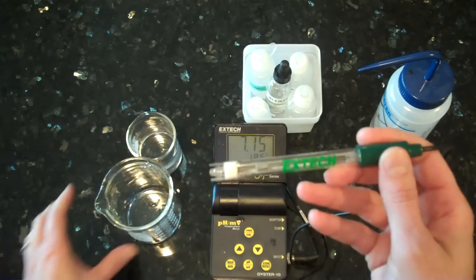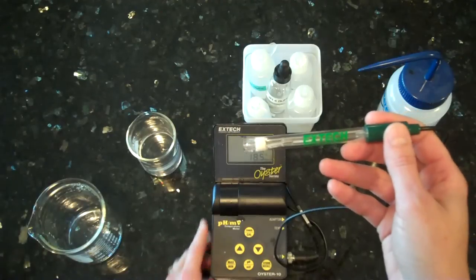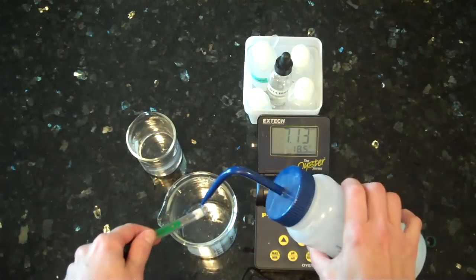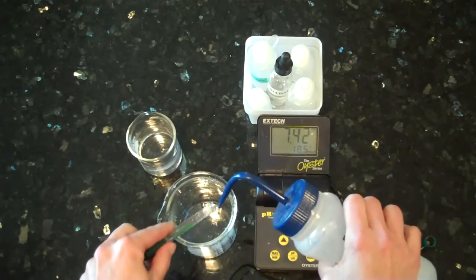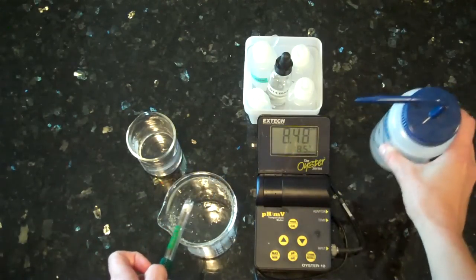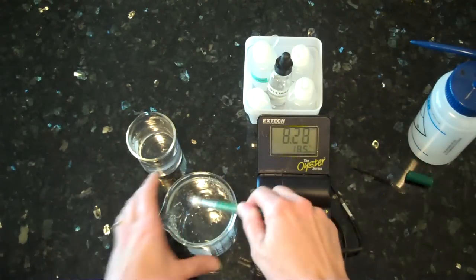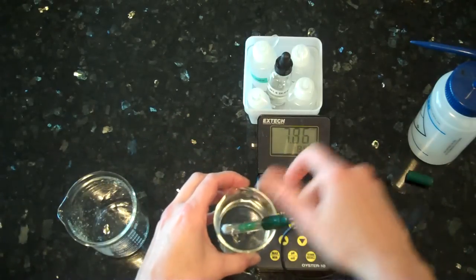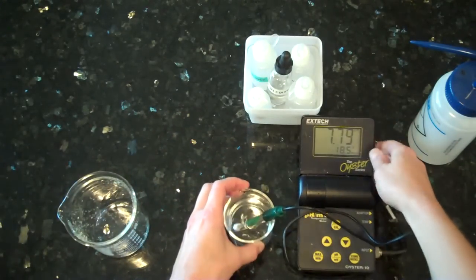In order to read the pH of a solution, the first thing you would do is simply rinse off the probe with deionized water. You do not dry off the probe; you can simply give it a little shake, and then insert the probe into the solution you want to read the pH of.